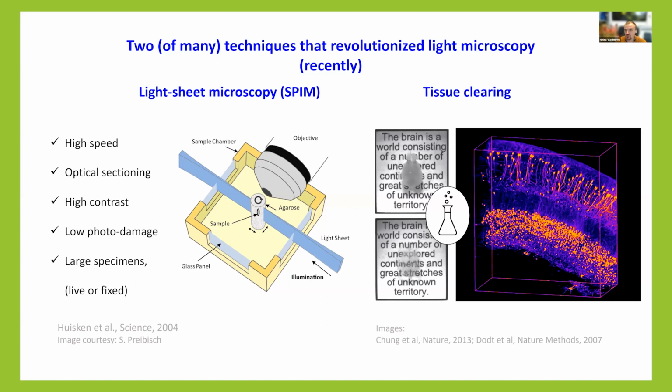And the other technique is tissue clearing, which allows you to chemically remove lipids from biological tissues and essentially make them transparent like glass. So the brains, for example, a mouse brain in the top image, it's just a fixed mouse brain, and after removal of lipids, it becomes transparent, but it retains the fluorescence, the fluorescent proteins and labels that are labeling some proteins of interest or other biological structures. And so these two techniques are really made for each other. Together they really revolutionize our field.